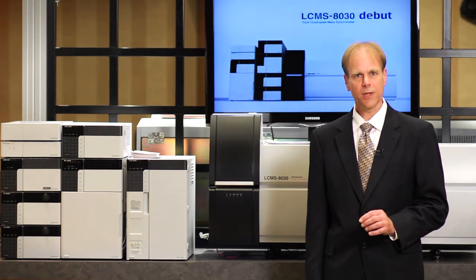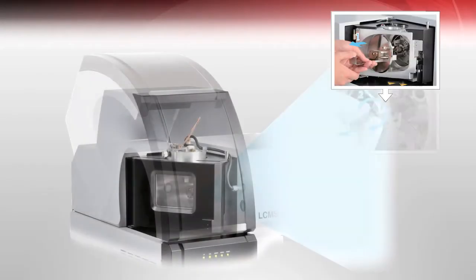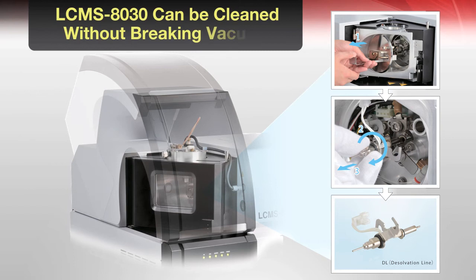The next thing I'd like to point out is the ease of maintenance on the instrument. Our interface can be cleaned without breaking vacuum — that is, we can remove the inlet capillary to the instrument without breaking vacuum. This saves the user an incredible amount of time when simple maintenance needs to be performed.